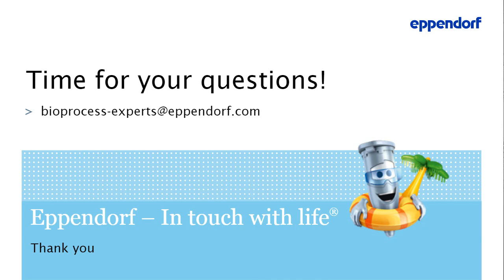Thank you. Another question that we have is, is it possible to cultivate adherent cells in a bioreactor? Yes, absolutely. There are a couple of options here. Depending on the type of cultivation or your cell line, you can either look at using fibra-cel discs, which could be used for vaccine production, or you can use microcarriers as the support matrix on which the cells can be grown in these stirred tank reactors.